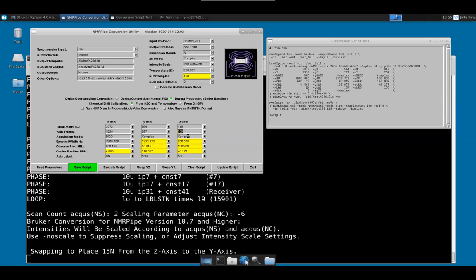Because when you stop the experiment earlier, you may not have hit the largest increment number contained in the sampling schedule. And therefore, the valid data points for the time domain, the total increments for both dimensions, need to be updated. Okay? So for real experiments, if you don't stop early, that's fine. If you stop early, read the parameter and calculate from that TD value from the ACQU2S file.